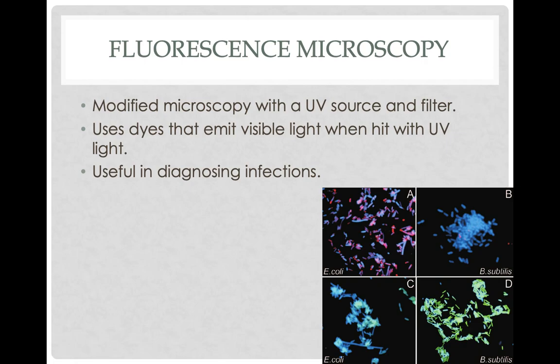Any type of bacteria that you're looking for will be tagged with this fluorescent dye, and then all you have to do is shine a UV light on it underneath the microscope, and the bacteria will show like glow sticks, which is pretty cool. So this could be a water sample where they've tested it for E. coli. Down here, the same thing. And what they did is they just poured some fluorescent dye on the water sample, put it underneath the microscope, hit it with the UV light, and then poof, there's the bacteria right there.